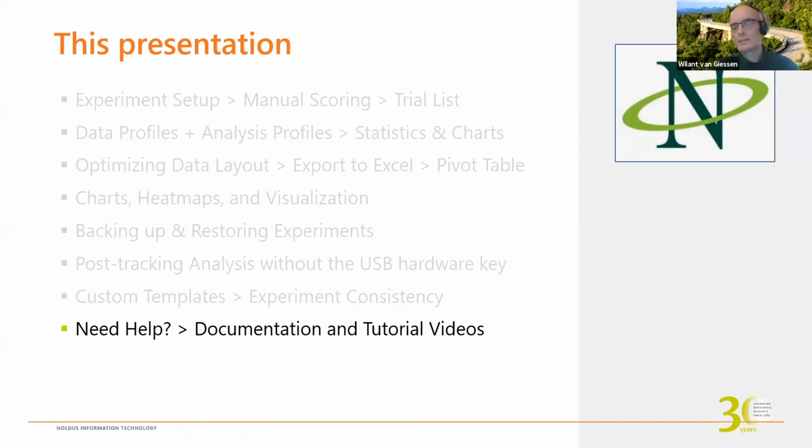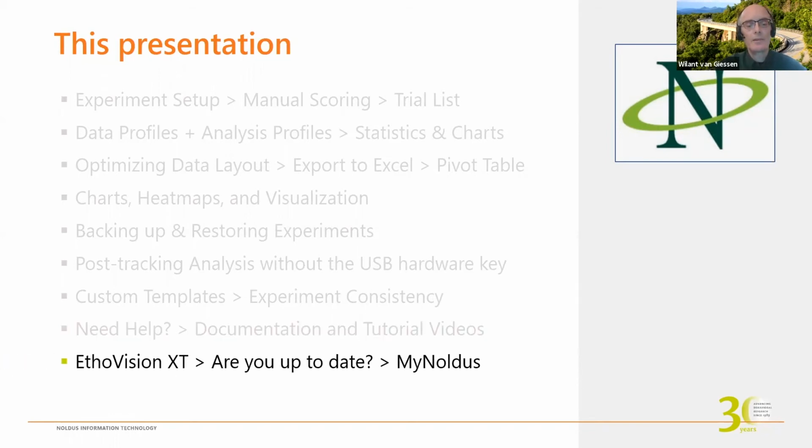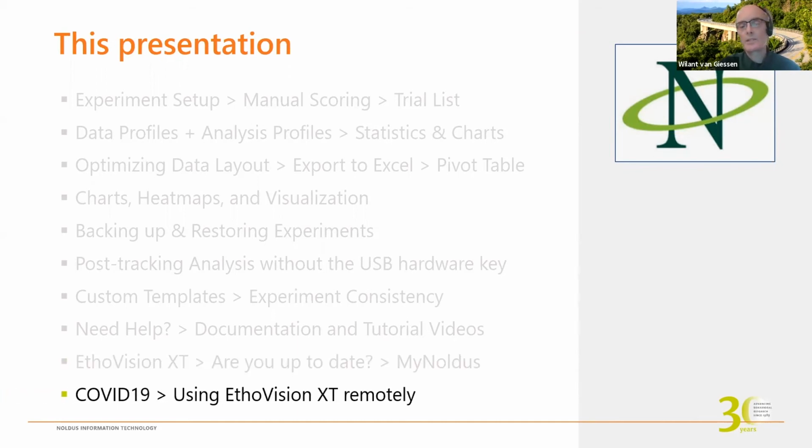And then I'll show you where to get all kinds of help in your documentation, videos, etc. And then I'm going to briefly check on whether everybody's using the latest version they're entitled to. Are you up to date? And that allows me to introduce our new portal called My Noldus. I'll show you how to do that setup. And then finally, we're still living in COVID-19 times, and we put something together so people can use EthoVision remotely if you can possibly work from home and still do some work. So that's kind of the overview.